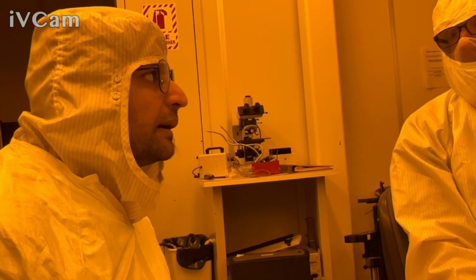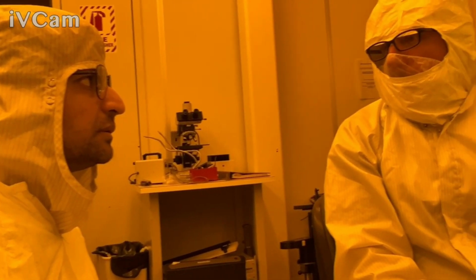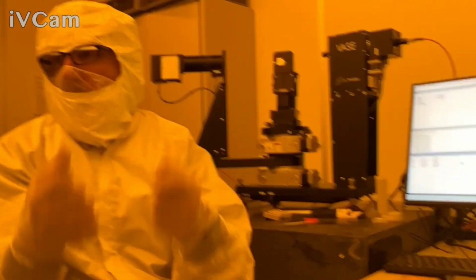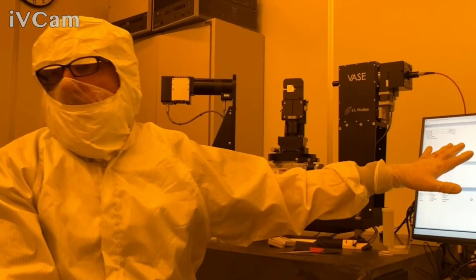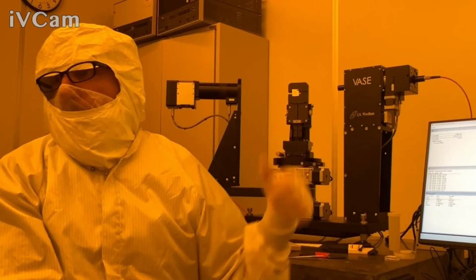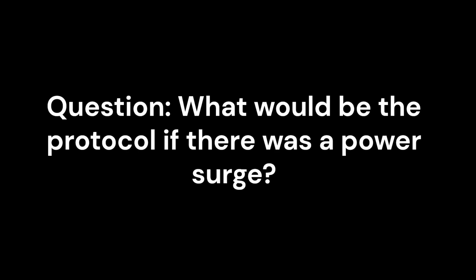So the easiest thing to do is just try it. Measure a sample that you believe has roughness and one that doesn't, and see if the ellipsometer is sensitive to it. It'll definitely improve the fit to include roughness in the model if it's there. This particular sample didn't, but again, this was just what we measured. This doesn't want roughness.